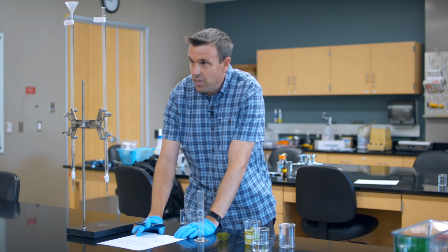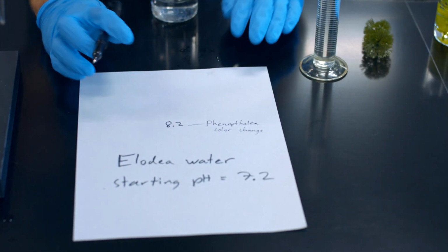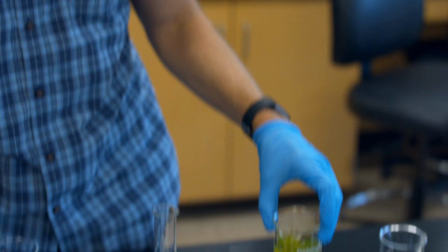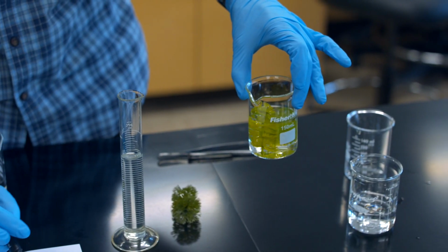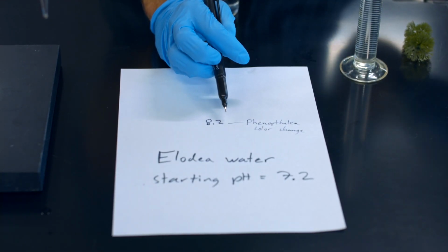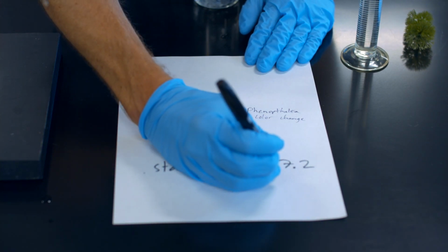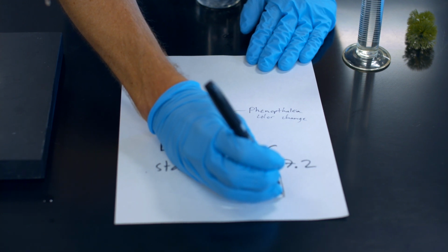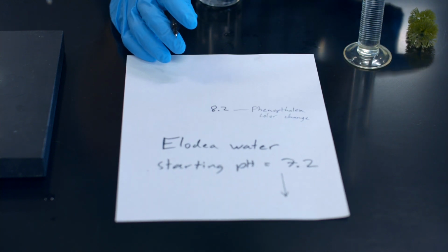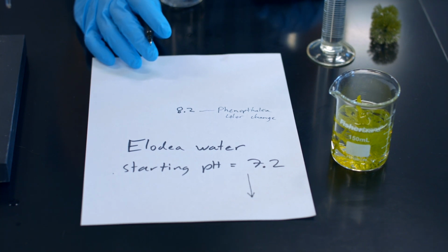So let's focus here and think about this for a second. This is in water that is at a pH of 7.2. It has phenolphthalein in it. But we don't see pink because remember, our phenolphthalein only turns pink, it has that color change at a pH of 8.2. So if this plant, as we know, is undergoing cellular respiration, that pH is going down because the cellular respiration is producing carbon dioxide just like with the fish, therefore causing the pH to go down due to cellular respiration.